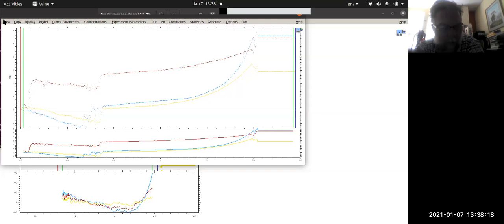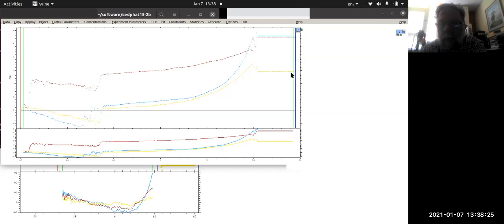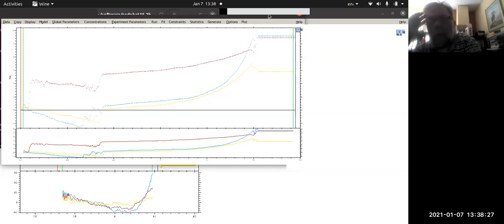Like I said earlier in the morning, I came back and I spun things to see how it would look in the old machine when it was trying to do 3 wavelengths. It probably was a pretty miserable experience for the instrument, and we'll see how well we actually end up getting data for that. In the meantime, I will probably put out a survey and email everyone.